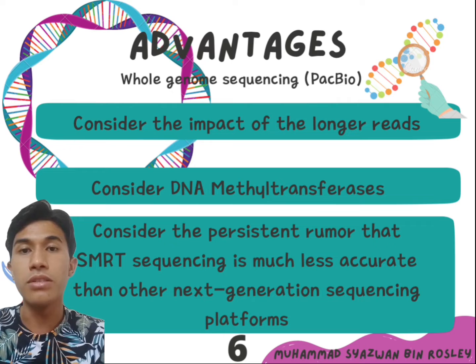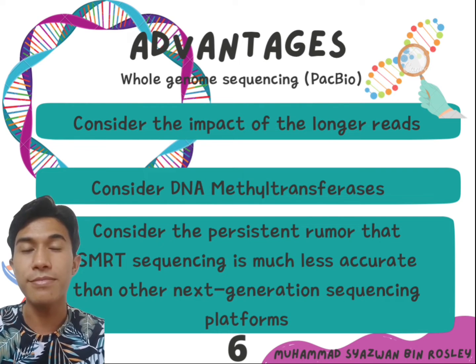Because the kinetics are changed, the timing of the fluorescence colors changes, allowing direct detection of epigenetic modifications and avoiding the need for enrichment or chemical conversion.